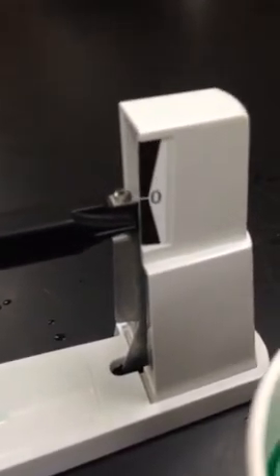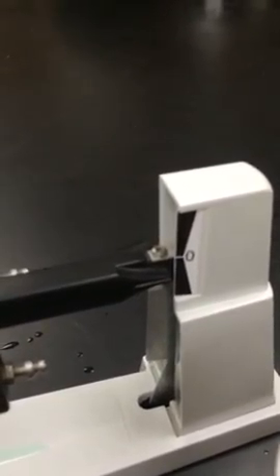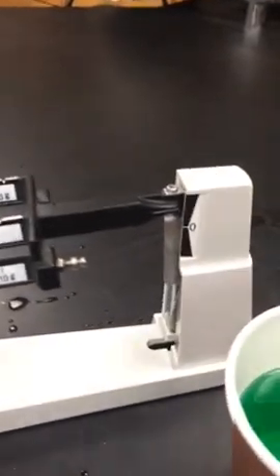So you can see I actually started turning it the wrong way. Okay, so we'll turn it the other way. There we go. Getting better. All right, a little bit more. All right, so now we're back at 0 and we can weigh our object. So we place it on our triple beam balance. And you can see it's not at 0. We want to balance it out.